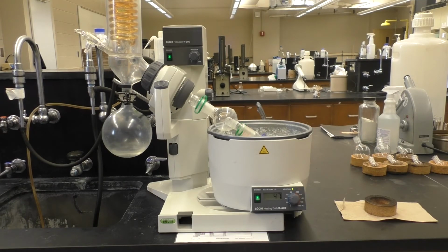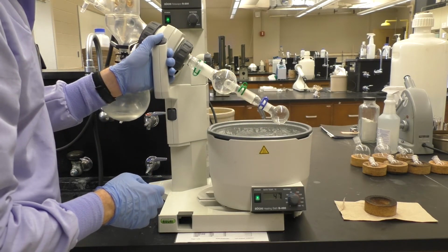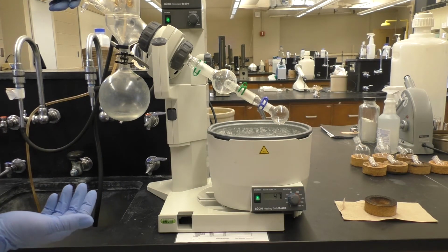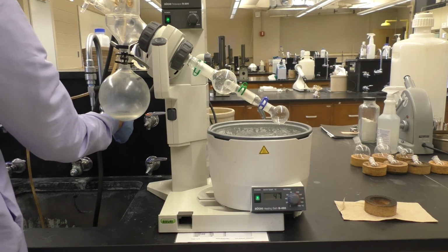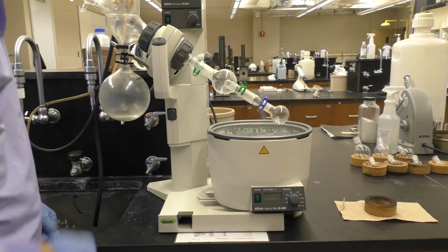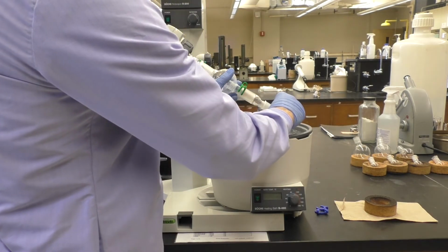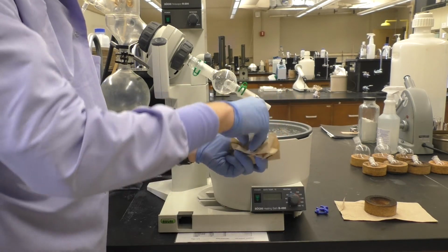Now that our sample has finished removing the solvent, we can turn off the rotation, raise the flask out of the bath, open the system to vacuum, or open the system to atmosphere really. Turn off the vacuum aspirator, or the water aspirator that pulls the vacuum. Turn off the chiller water. Turn off the water heating bath and the column. And now we're set to simply remove the clip and remove our flask from the column. It's got some water on the outside, pretty normal. Just sort of dry that off.